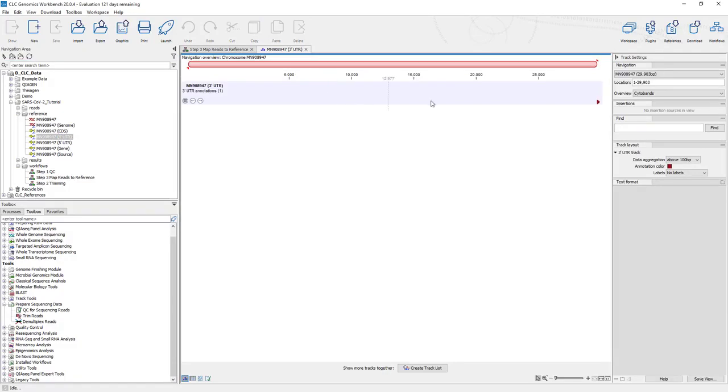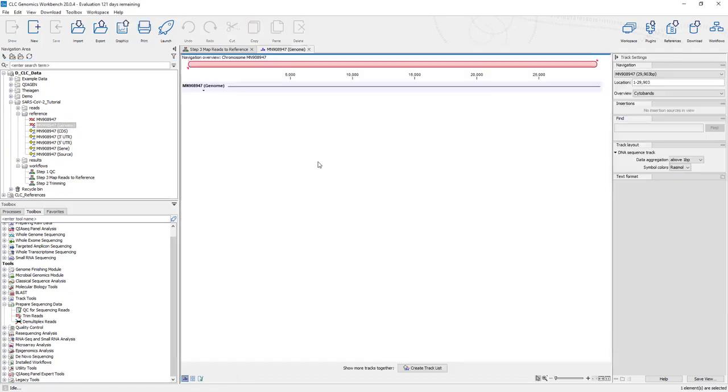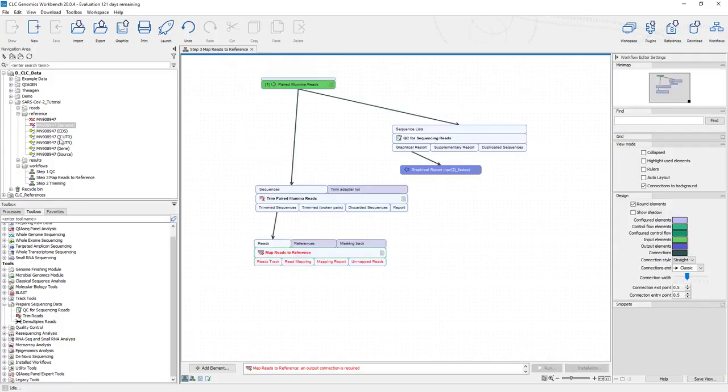This one is defining the 3' UTR over here, etc. But the one we're most interested in is this one marked genome, and the genome is what we're going to use for our workflow. So you can see it's essentially just the genome sequence in there all alone.